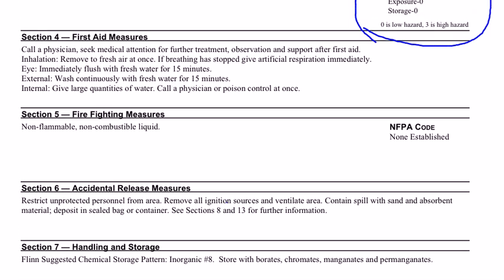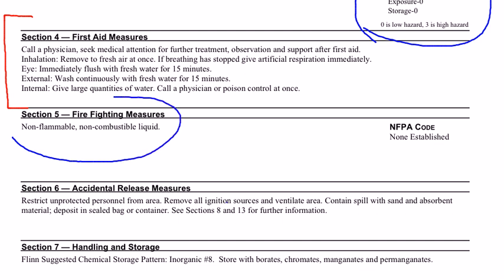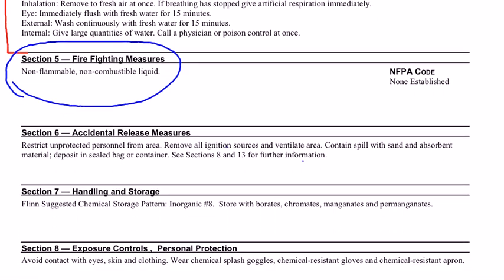Much like the hazard section, you also need to pay close attention to the first aid section — what to do if you accidentally inhale the vapors, or if liquids get behind your goggles. You also need to notice Section 5, which is the fire measures. This is a non-flammable, non-combustible liquid, so we're probably not going to be dealing with fire measures, but it's always nice to read that section to be sure.